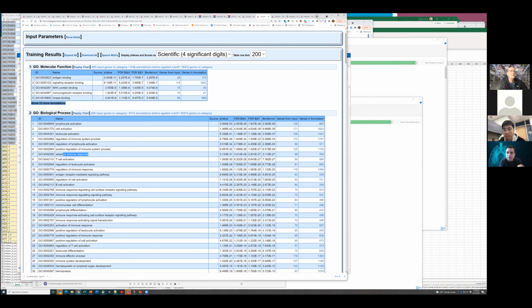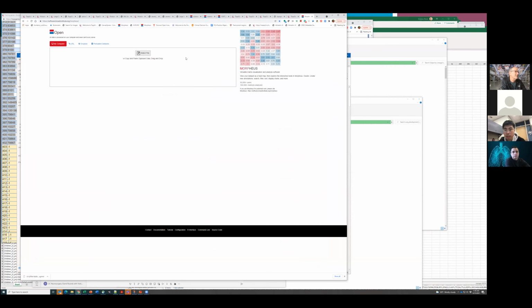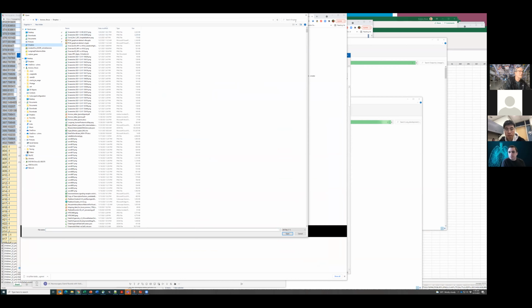Oh yeah, absolutely. I've been working on the proteomics data, and I can show you what the view is going to be on the system. I really want to see what the proteomic signal is by transcriptomic signal, in specific ways.